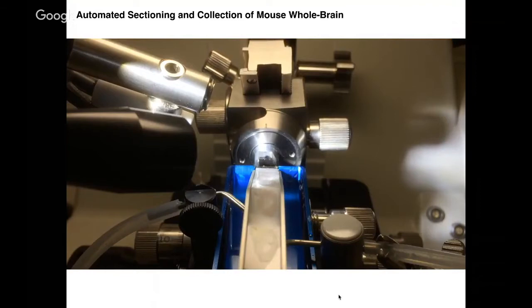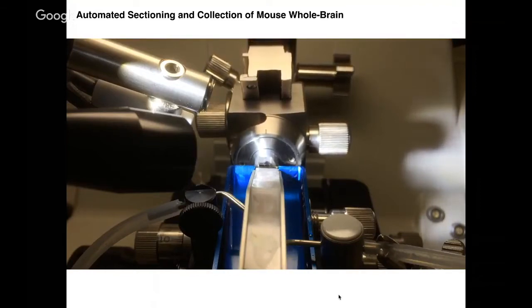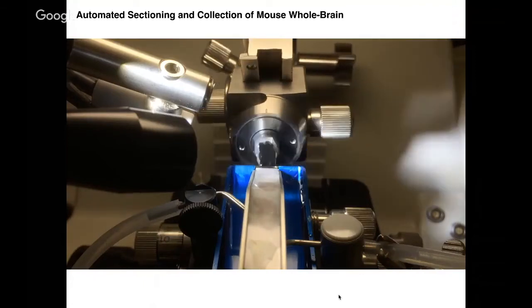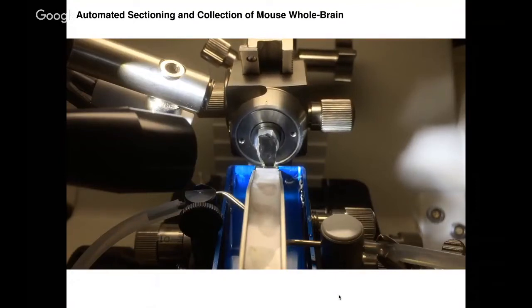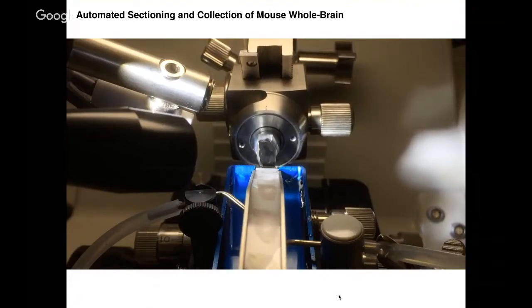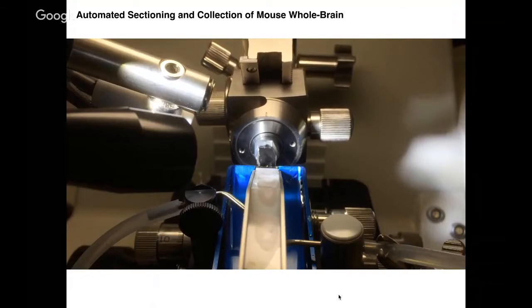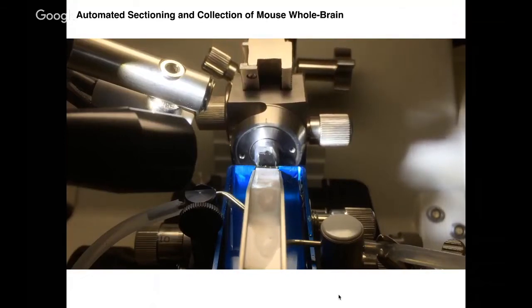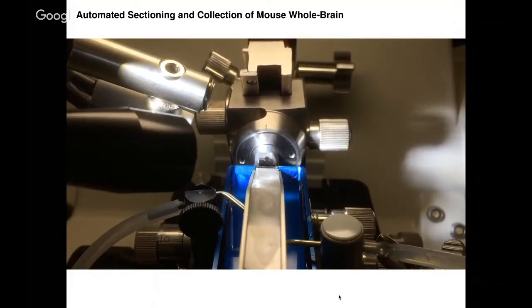And what I found most remarkable was how easy it was to get this working. And so this made me optimistic that whatever remaining problems there are with regard to section thickness or section quality or number of sections, these are things that would be much easier to solve than trying to get alternative approaches to work. And so I focused my attention almost exclusively on the serial sectioning approach.